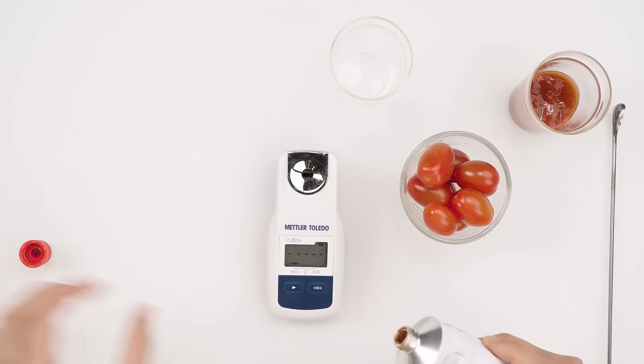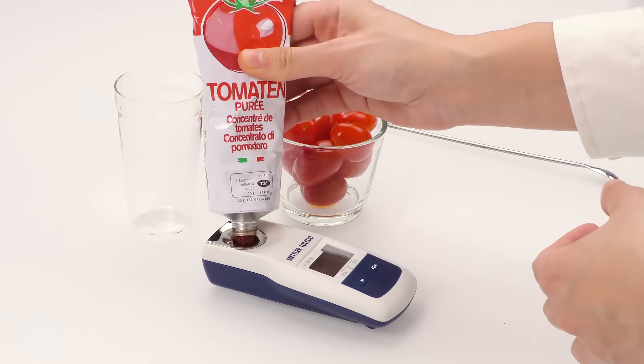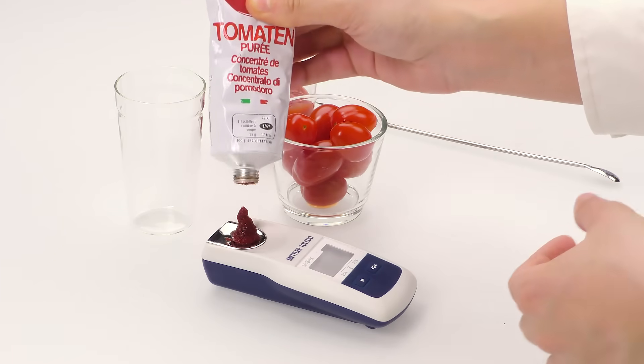Tomato sauce is also quite dense. It can directly be applied on the prism, but it needs to be nicely pressed to avoid air pockets.